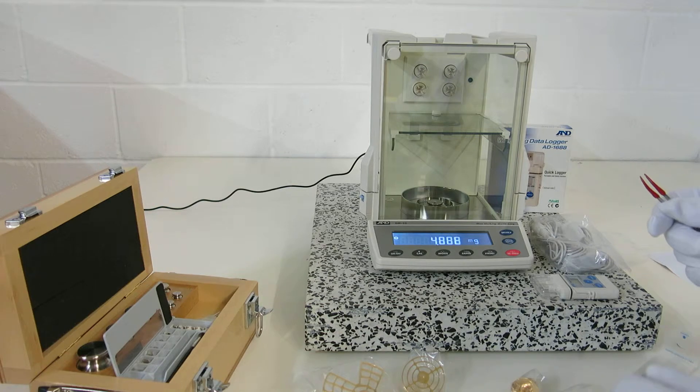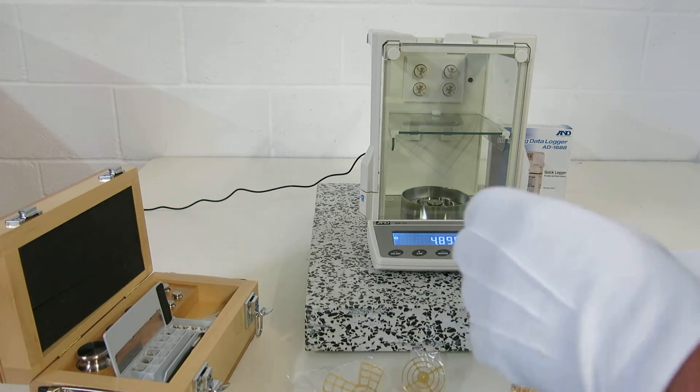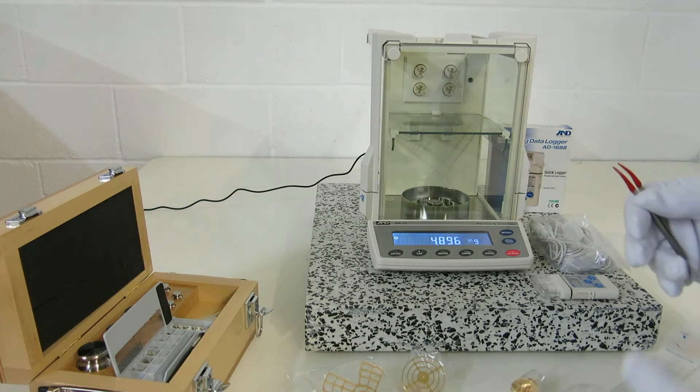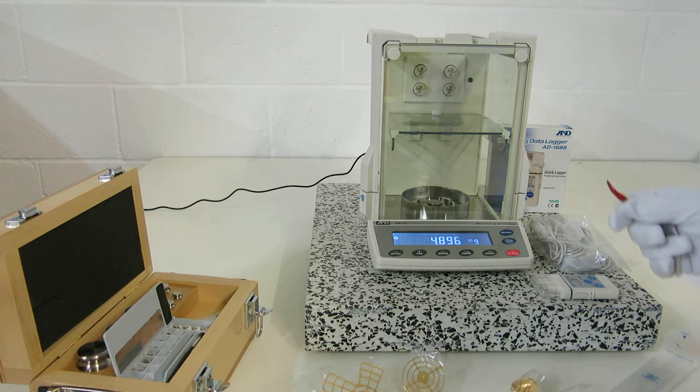Let's give it some time to stabilize, which it's doing, slowly creeping up. Okay, so the idea here is, I mean we could be here for another half hour, but the idea is to give you an overview of the instrument itself. You can see that this is nicely moving up now.